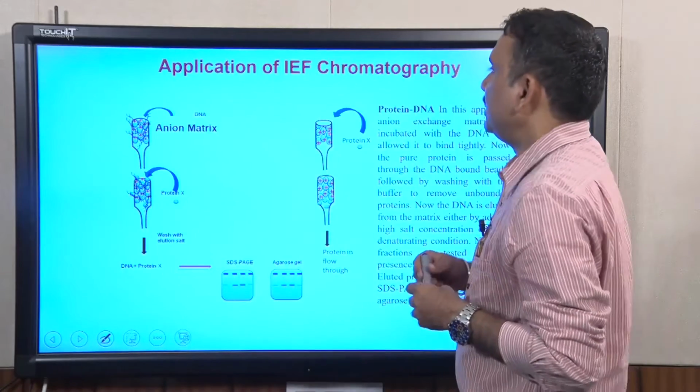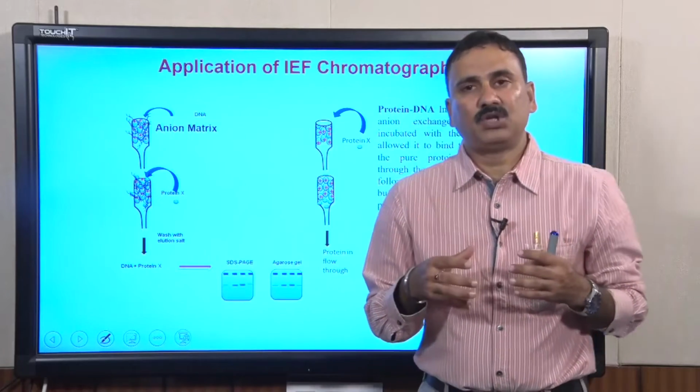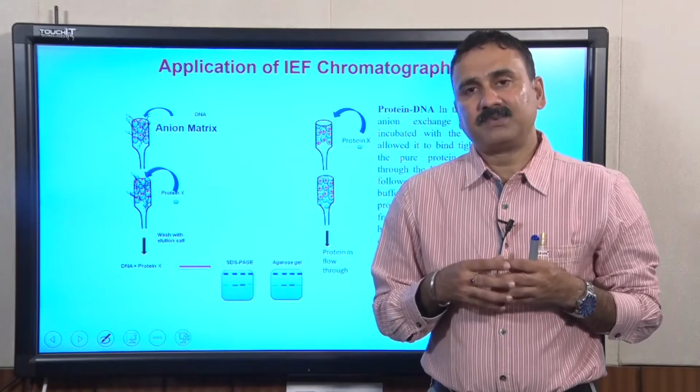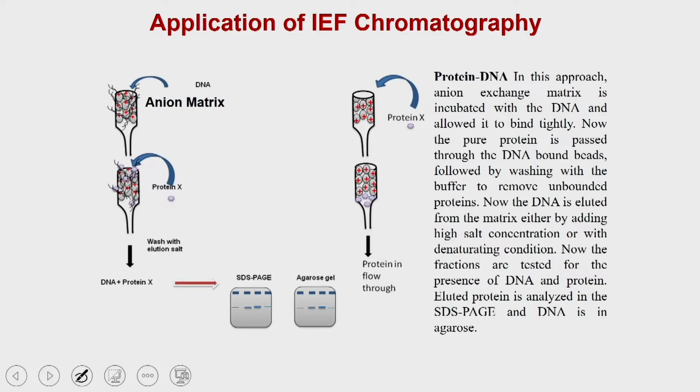So, the first application we are going to discuss is the utilization of ion exchange chromatography in developing different types of assays or studying the interaction between two biomolecules.